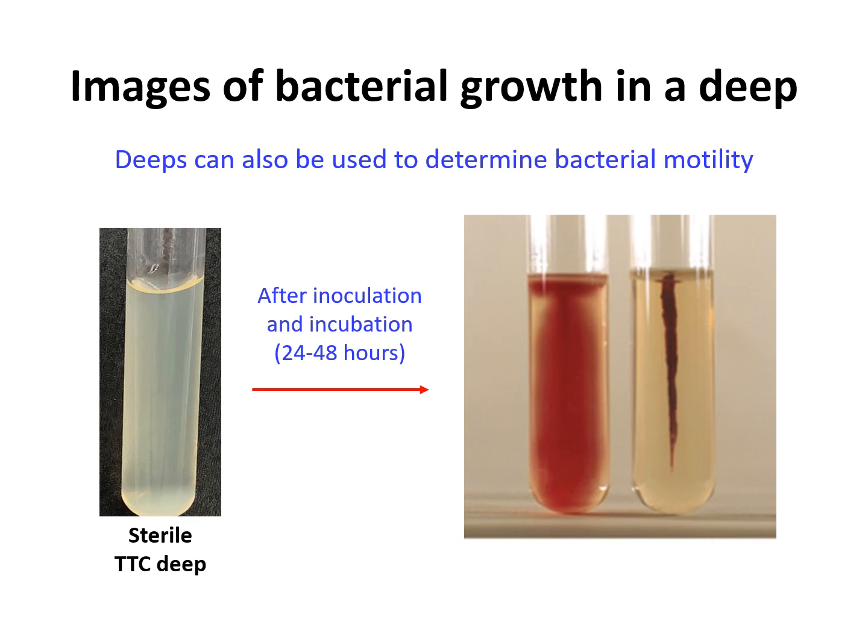Now, we also said a deep has another purpose, and the other purpose of the deep that we use them for is to determine the bacteria motility. We want to figure out whether our bacteria is motile or not, okay? Now, again, as we said, with a deep, you go ahead and you stab it.